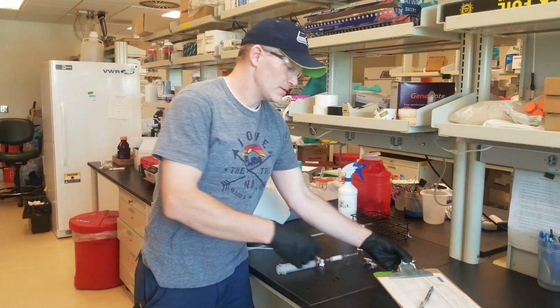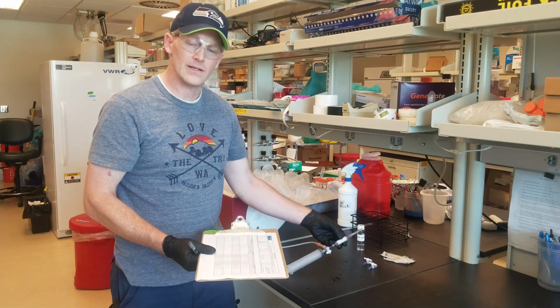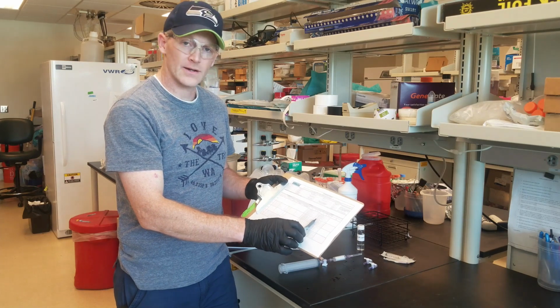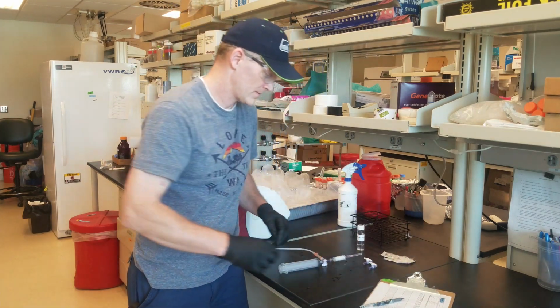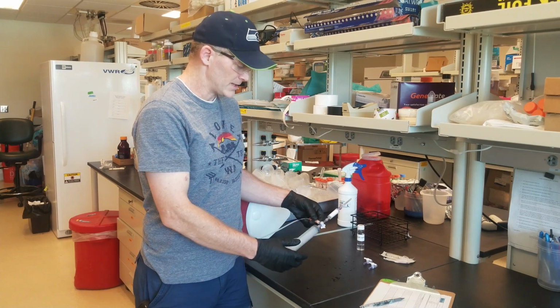So one thing that's really important is the Sterivex is going to have a sample ID just like the vials. And you want to make sure you record the Sterivex sample IDs on the hard copy data sheet. There's one for the surface water and one for the push points. So this is what it should look like in the field, three-way valve setup.